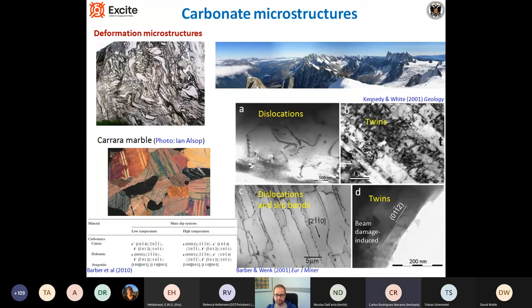We can also study deformation microstructures — dislocations in deformed material, twins, dislocation slip bands. We also have to be very careful because beam-damage-induced twins can be an artifact while we are observing the sample.